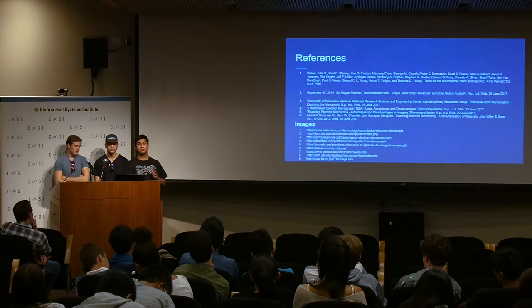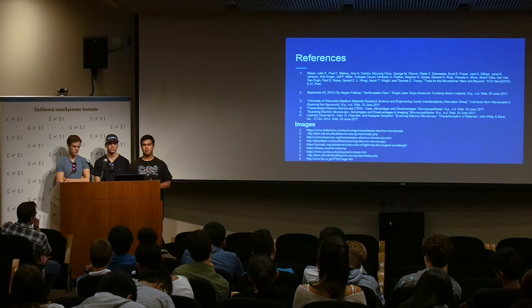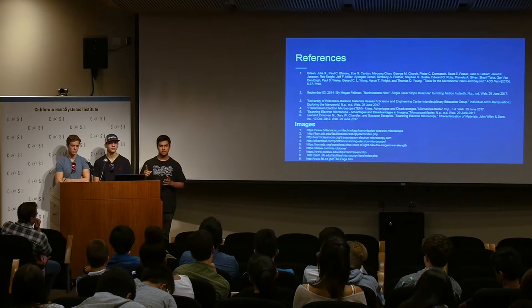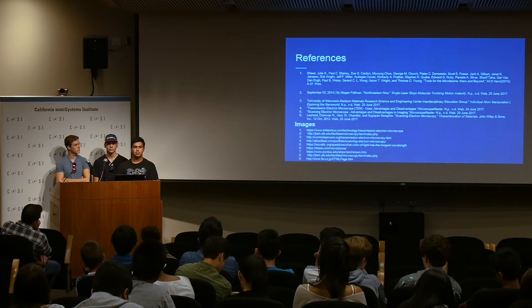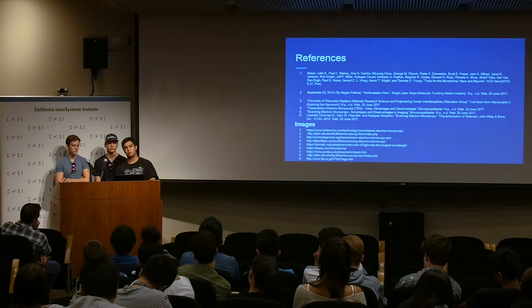Basically, what we're trying to do is improve the resolution of the images. So right now, both the SEM and TEM obviously do great work. But the biggest issue is that with the molecules always zipping around and vibrating in solids, it's hard to get a clearer picture. It works the same way on the micro scale as on the macro scale. If you're trying to take a picture of a ball flying through the air, it's hard to do. But if we're able to slow down that motion, we are able to get a deeper image and see more details, which will help our studies.